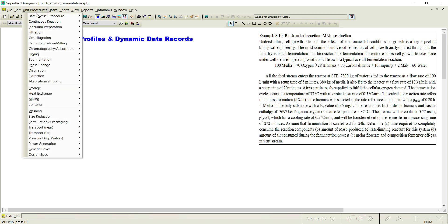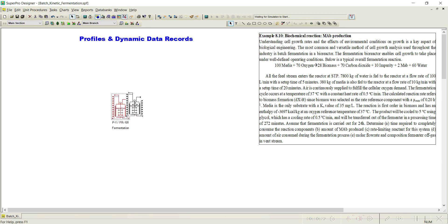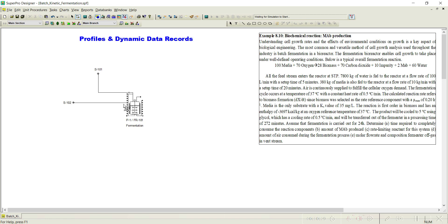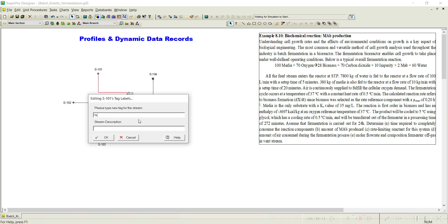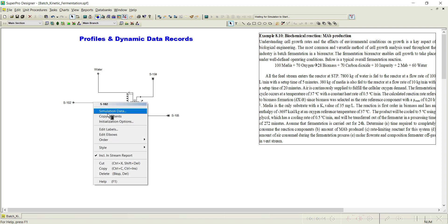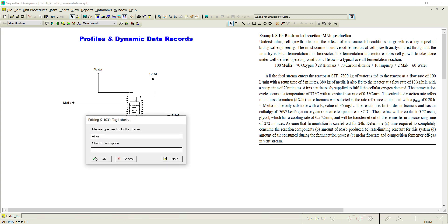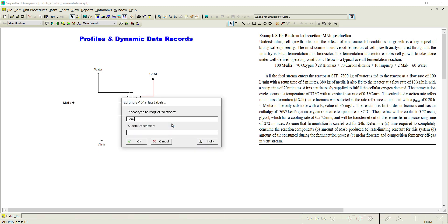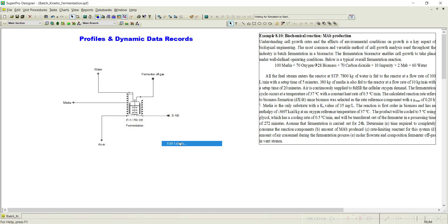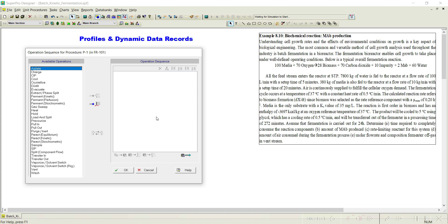Now go to the unit procedure, select a fermenter and place it on the flowsheet. Once you select the fermenter, we need to add the inputs: we need to add water, charge the media, continuously supply air, continuously remove the fermenter off-gas, and define the product output. Let us rename them: water, media, air in, fermenter off-gas, and product.